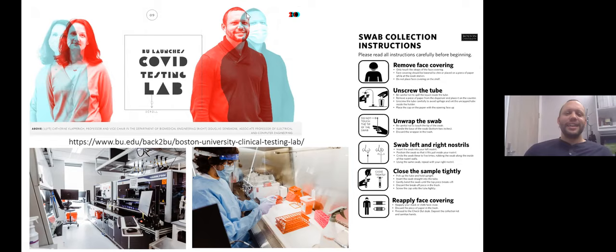And then when we went through the process, we realized, well, no, it's not one robot. It's 8 robots, 5 QuantStudio Flex qPCR machines, 30-some full-time staff working in multiple 7-hour shifts to do this. And I don't know if there's 4 or 5, I've lost track of the number of collection sites, and a huge effort to do that.